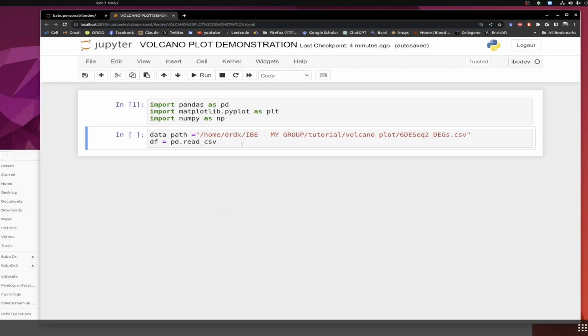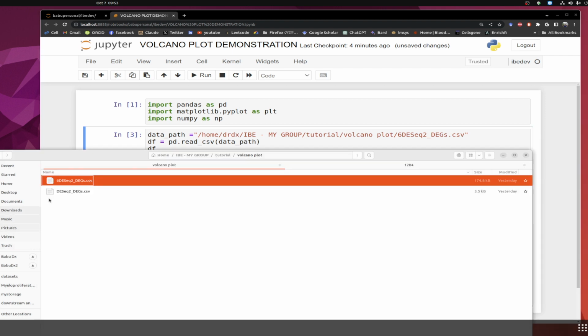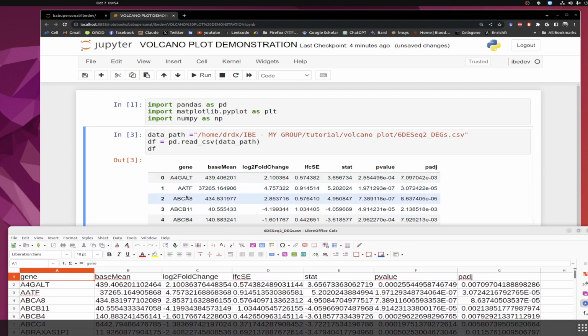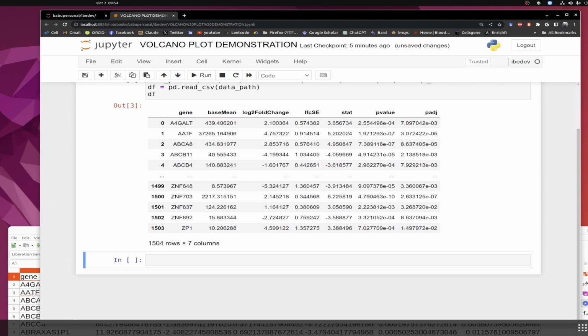So let's go back. We put it in the Pandas data frame and put it like this. Do you see it? So it did, and we check it out actually. Does it synchronize with the data frame we have? So we have it in here. Let me make it smaller. In here we print a couple of them. That looks fine. So log2 fold change is one of our major interests, and another one is p-adjusted. It's very important you go step by step and understand your data.